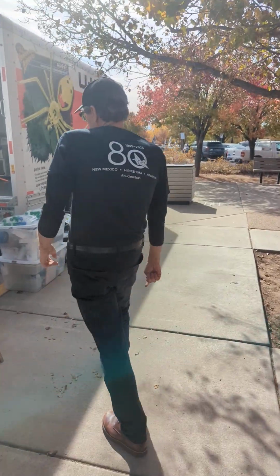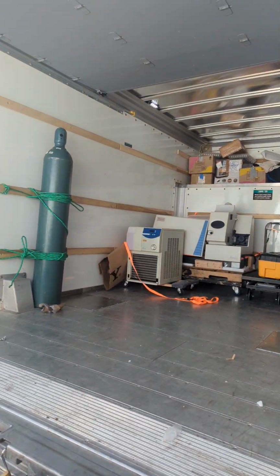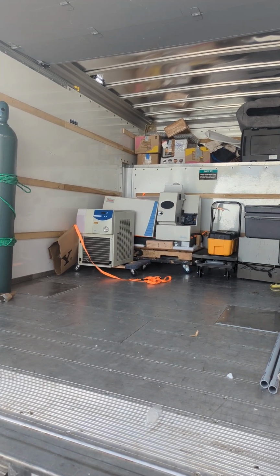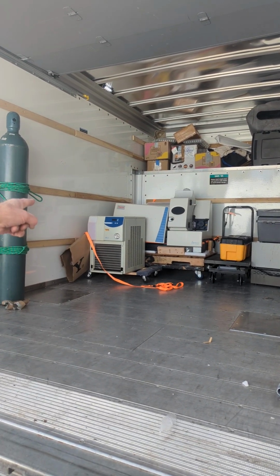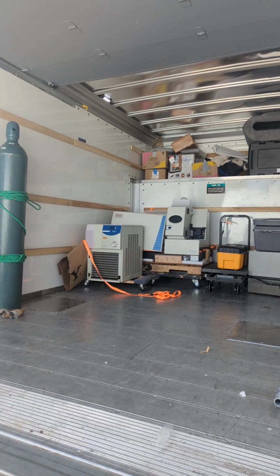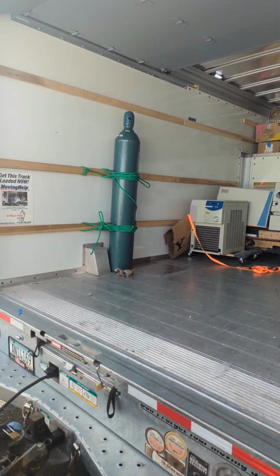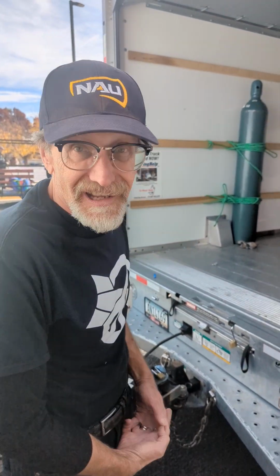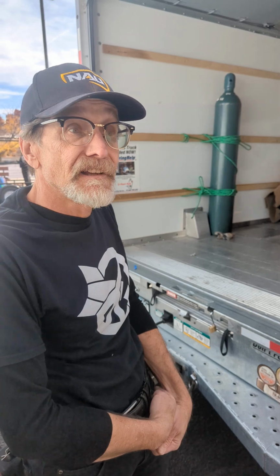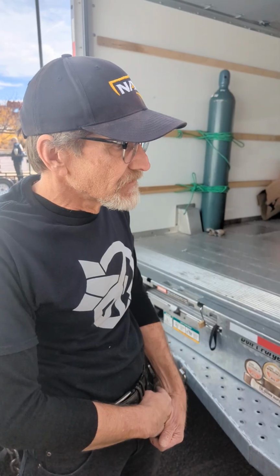Come over this way. If you look in here. That's the next one we're putting together. What is this? That's an identical ICP-MS. And I'm going to assemble over the next few months all the bits and pieces that we need to clone this. It'll probably be a laboratory that's in a fixed location, like a shop or a garage or something like that, because all the work that they need is concentrated in 2 counties. There's more than enough to keep this instrument busy full time with all the environmental samples from those areas in Pike and Scioto County in southern Ohio, and probably other counties like Ross. But there's many sites all over America that really need this.